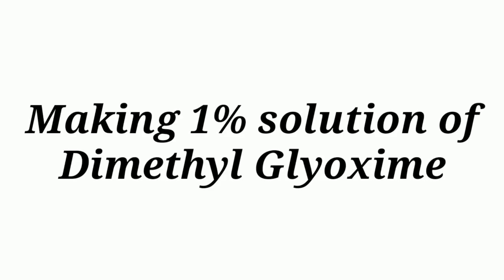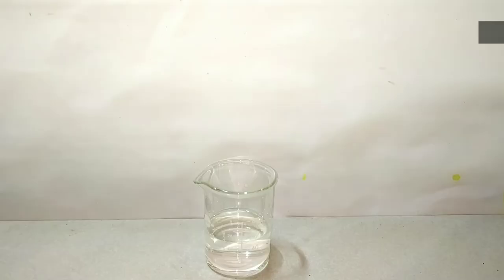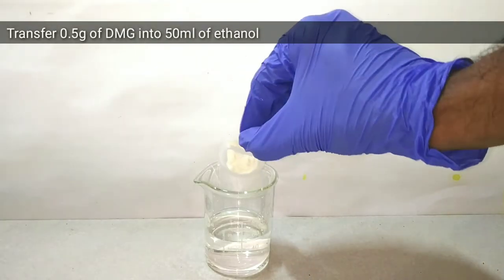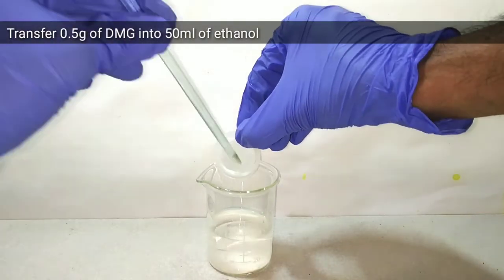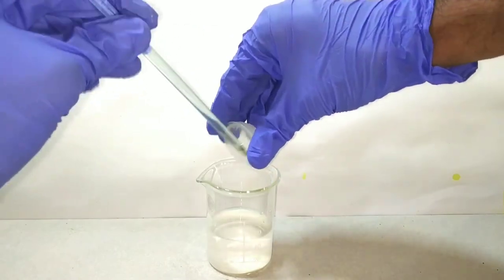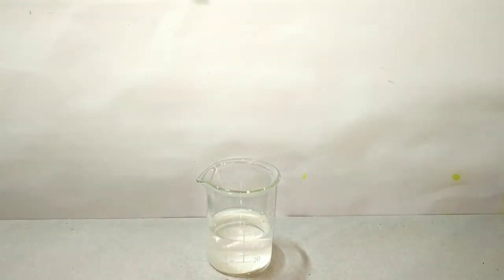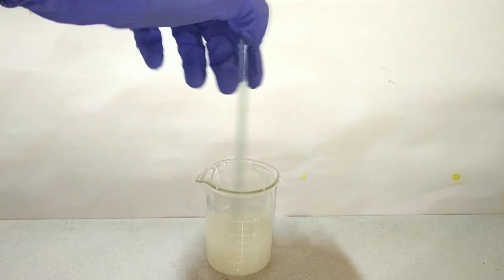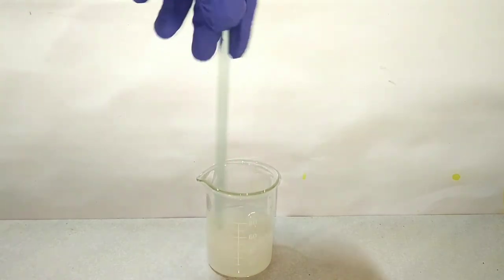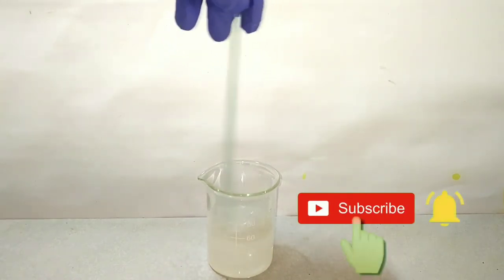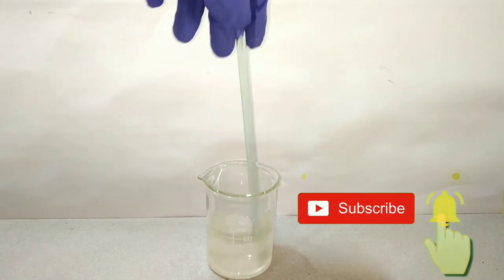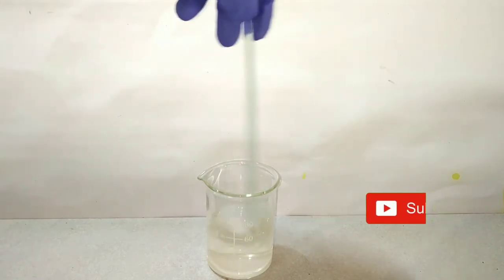Next we make 1% dimethylglyoxime solution. For that, transfer 0.5 grams of dimethylglyoxime into 50 milliliters of ethyl alcohol and mix well. Dimethylglyoxime is not very soluble in water, that is why we need the help of alcohol. After mixing it well, we get a clear solution.